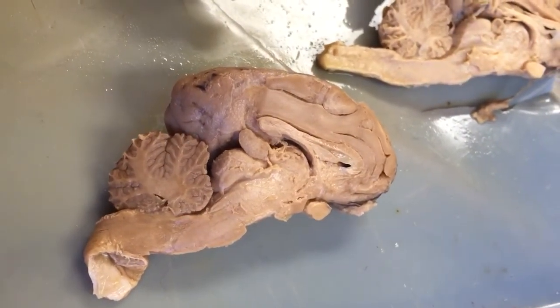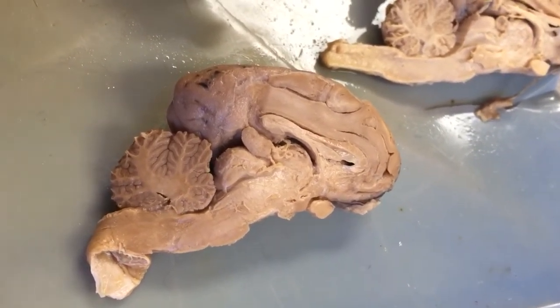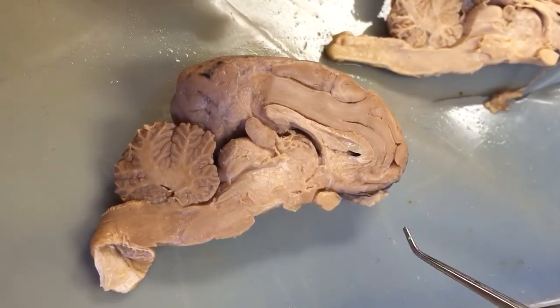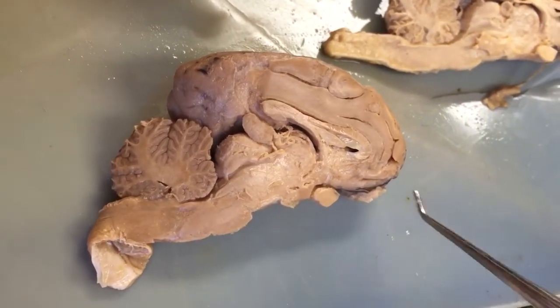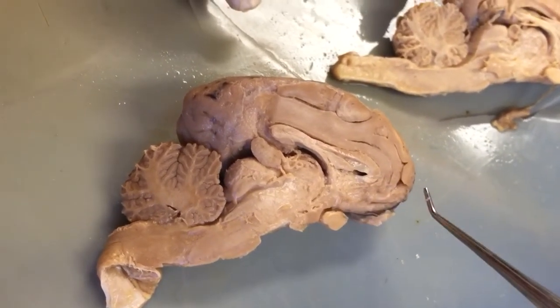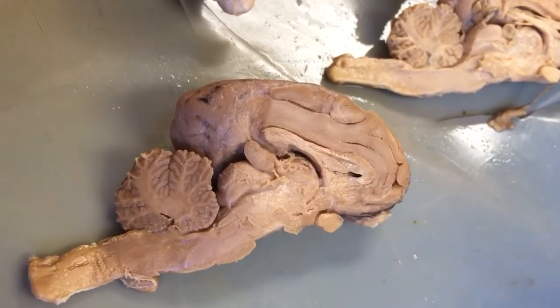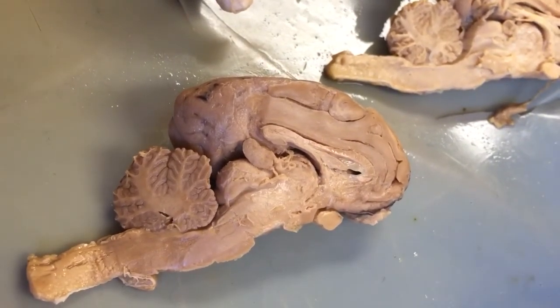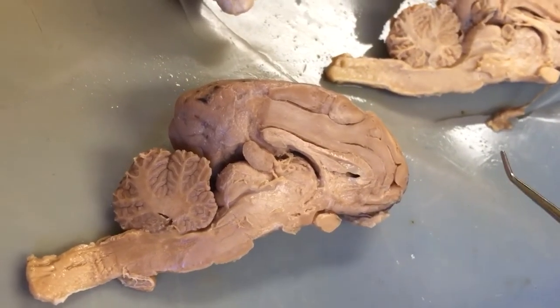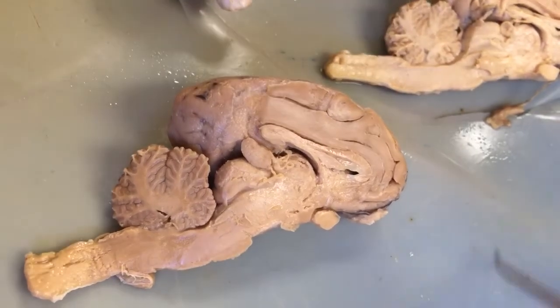So you can see that some of these get really, really minor, whereas some of the others are large structures that I really want you to know. Of the minor, really challenging structures in this medial section of the brain, I'm not going to ask you more than a couple of those questions. I'm going to concentrate on the more conspicuous structures to identify.